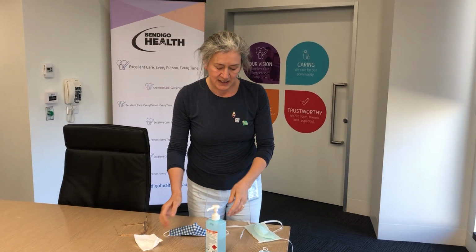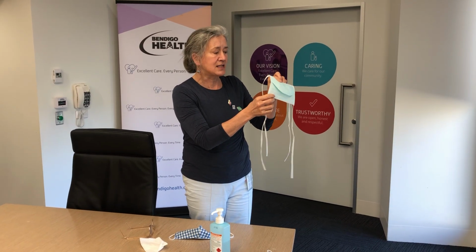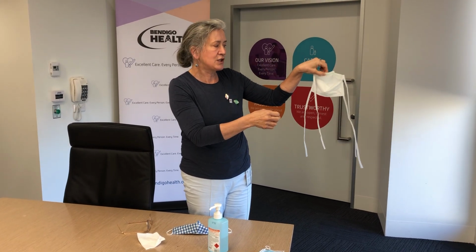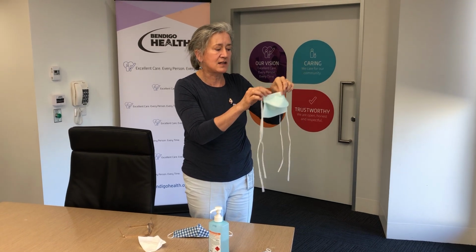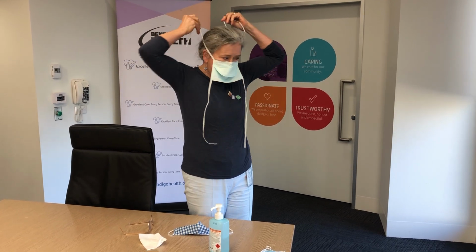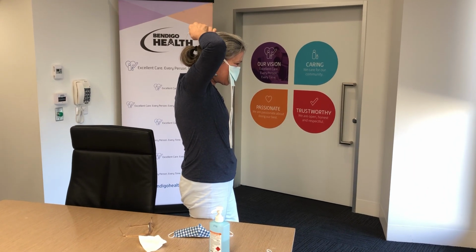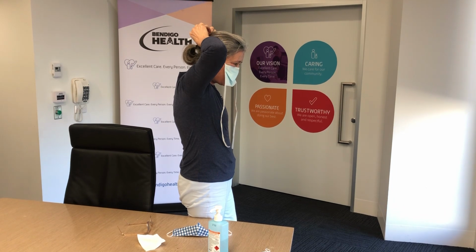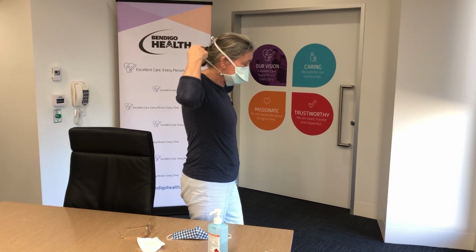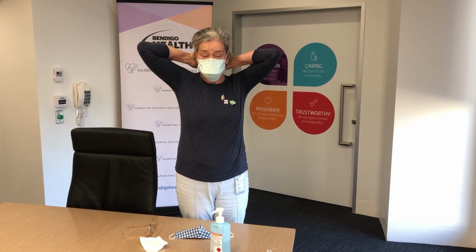Last but not least is a slightly different mask. Again, my favourite because it has ties, and so once you've again worked out which is the front, which is the inside, which tends to be the white side, you can create the shape, pop it on your nose, and what's nice about these ones is you can tie them up high, and so if you're going to have to wear them for a long time, they sit slightly more comfortable. So you do the top first and then the bottom, which can be slightly looser, but it just allows slightly more movement.